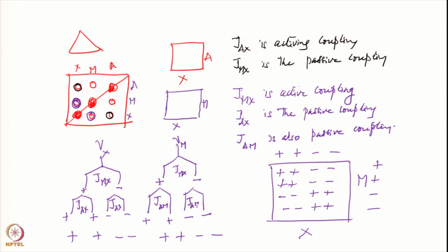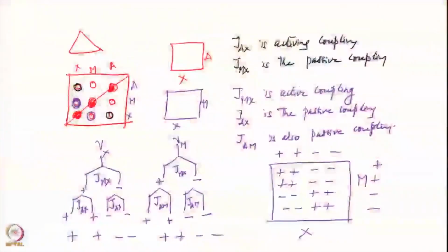So, 16 components. Each of the cross peaks here will have 16 components. Unlike in the previous case, depending upon how many couplings are present in each multiplet structure, you have to multiply by that many components. So, if one side has 4 components, the other side has 2, then there will be 8 components in the cross peak. If both sides have 4, then you will have 16 components in the structure, and the locations of the pluses and the minuses will depend upon the relative magnitudes of the coupling constants.